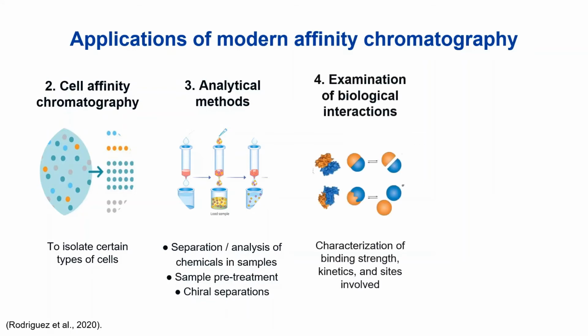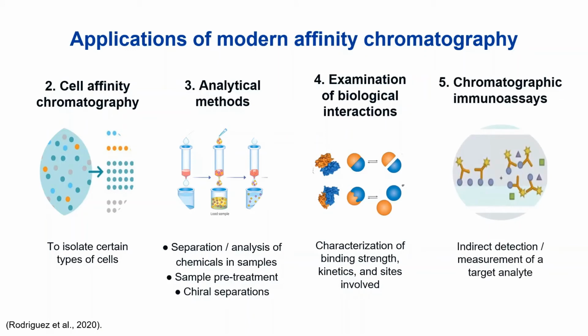Also for the examination of biological interactions to characterize their binding strength, their kinetics, and the number or types of sites that are involved, for example between proteins or drug protein, enzyme inhibitor, antibody antigen, etc. Finally, it could be used for indirect detection and measurement of a target analyte by chromatographic immunoassays.